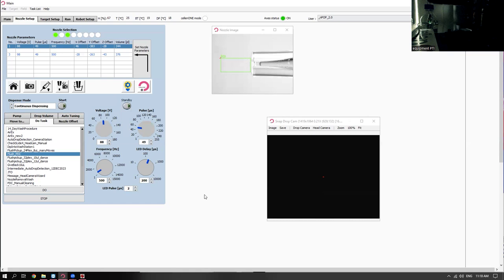We isolate only the elongated cardiomyocytes. So we say, okay, we essentially want only things that have an elongation factor greater than 4. All of the ones that are damaged hypercontract, and so we don't take these round ones. There are a few different ways that we can play with that. It may be that there would be some kind of custom software thing that we would do, but it really depends on what those images look like, right?